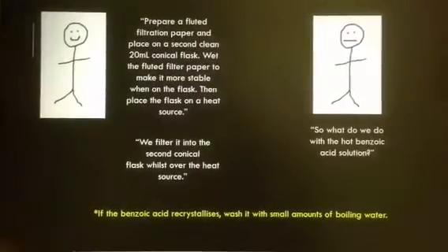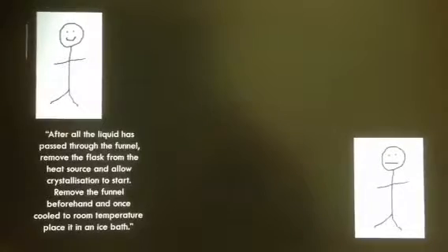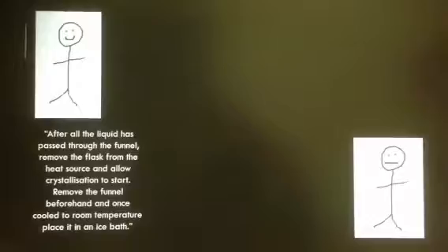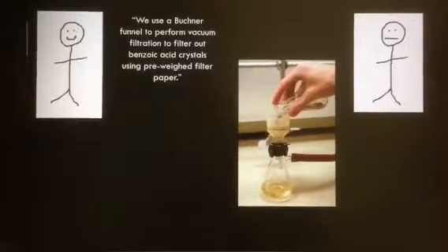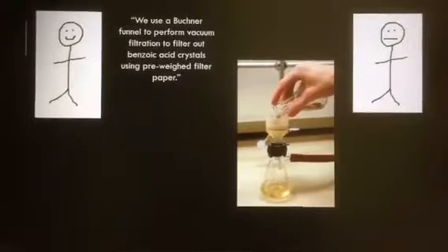If the benzoic acid recrystallizes, wash it with small amounts of boiling water. After all the liquid has passed through the funnel, remove the flask from the heat source and allow crystallization to start. Remove the funnel beforehand, and once cooled to room temperature, place it in an ice bath. We use a Buchner funnel to perform vacuum filtration to filter out the benzoic acid crystals using pre-weighed filter paper.